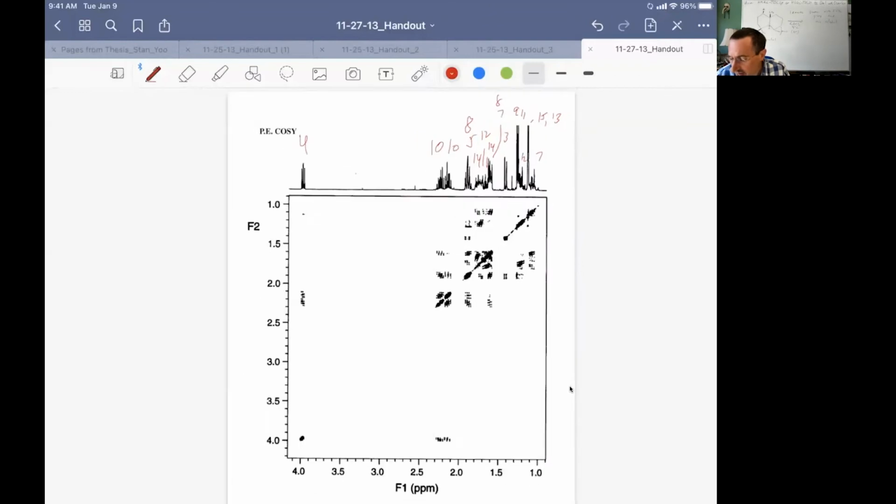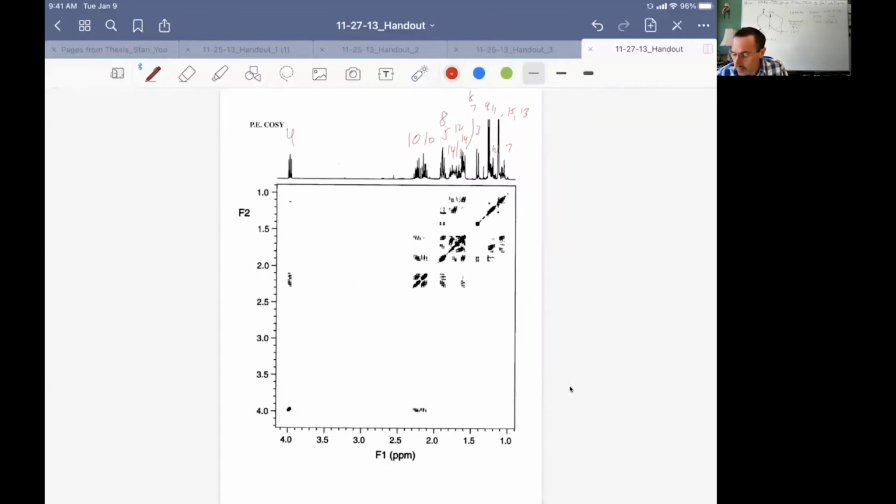We try to make our way through this COSY, and we can start to see a cross peak here. So we can at least say, okay, 4, which is a methine, is crossing with 10, right? So at least we can make some sort of correlation here. Then if we come over here and say, who does 10 cross with? 10's diastereotopic.